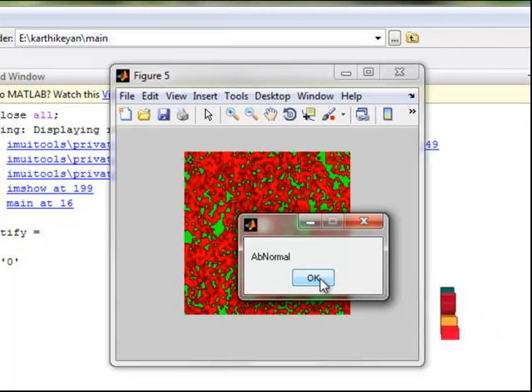Our approach using tissue slices also demonstrates the feasibility of imaging within tissue and the reliable quantification of ultramorphology and cytoarchitecture to map various tissue scales ranging from the multicellular bundle down to the subcellular sarcomere arrangement. Thank you.